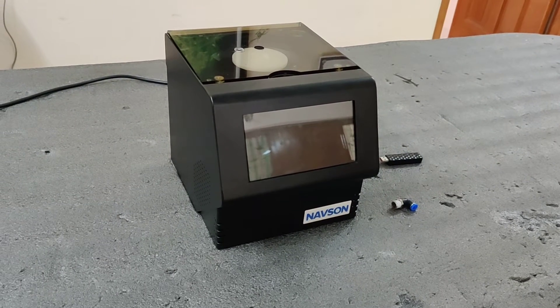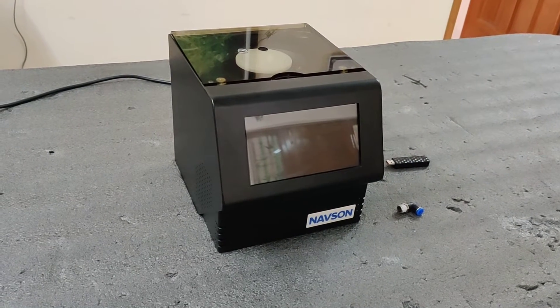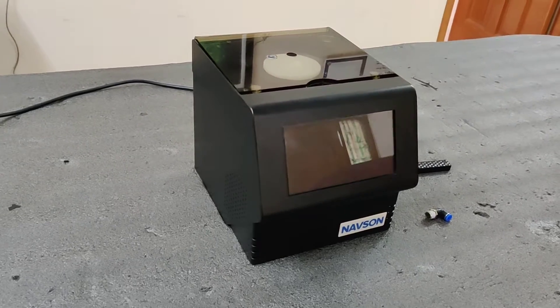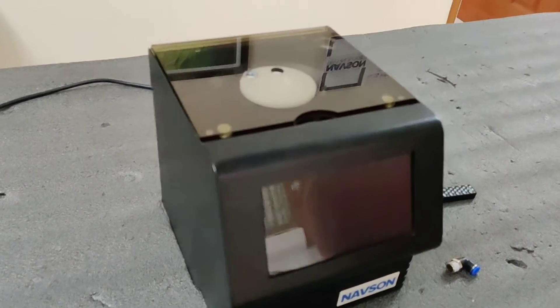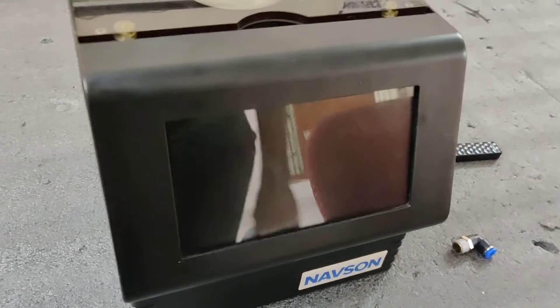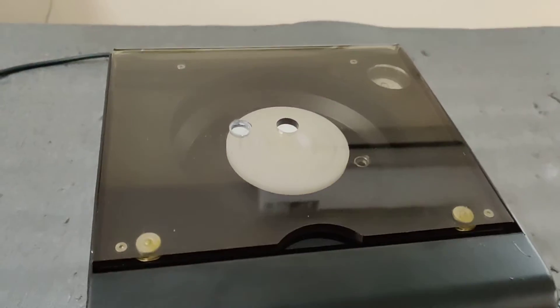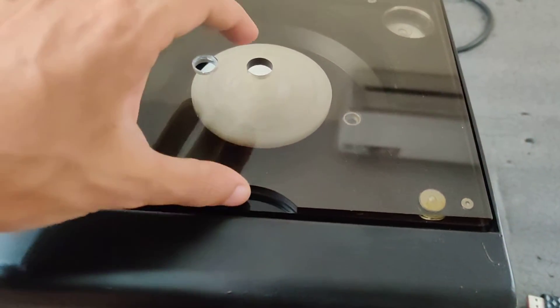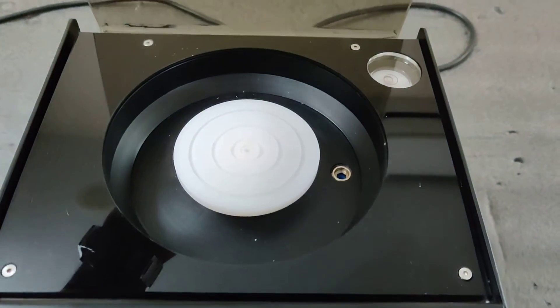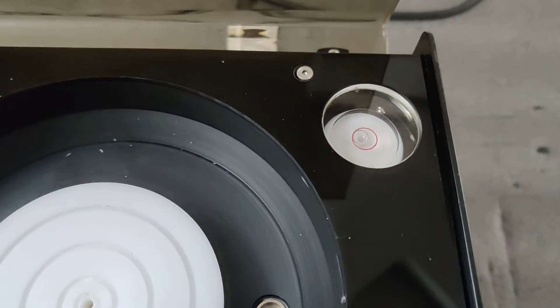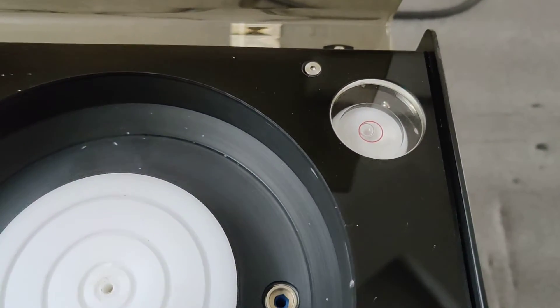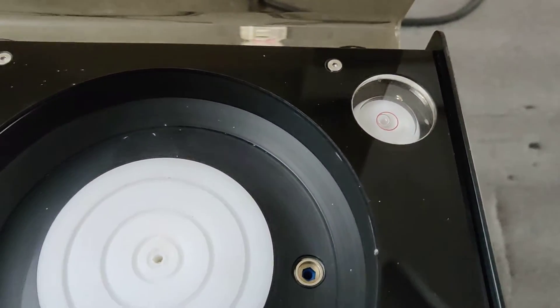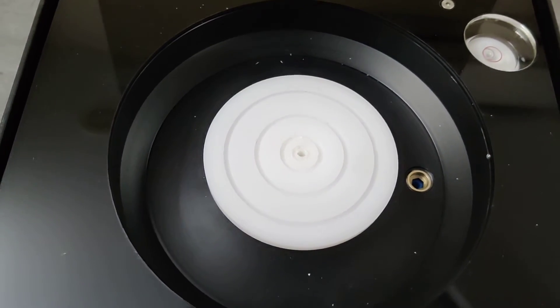So this is the Navson NT12000V1 spin coater. This is the main display section, this is the lid. This is the spirit level. You can adjust the level of the spin coater with the legs that are available in the bottom.